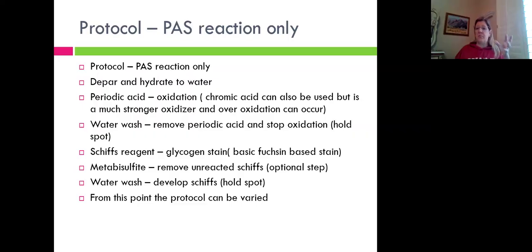Because if you leave that bottle sitting out, it's going to sort of ripen, and ripening isn't the right word. It's going to develop with the sunlight and the air. So once that bottle starts to develop, it's going to get weaker and weaker and weaker. So you want to take what you need and put it back in the fridge. That's a trick of the trade.